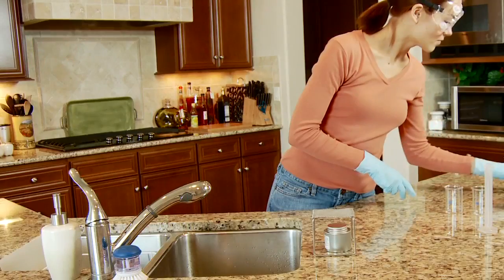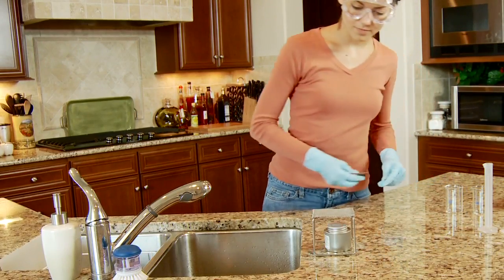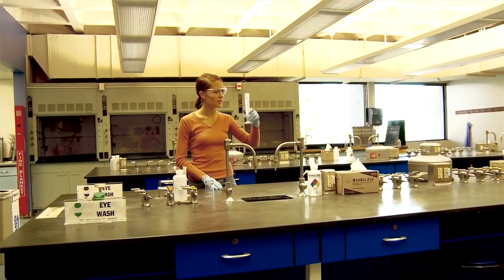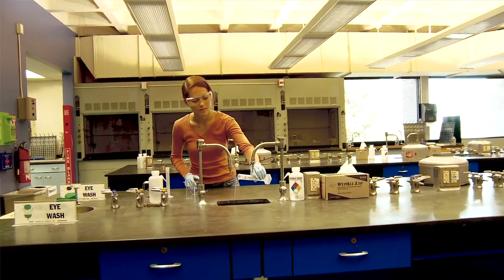In addition, you will learn how the safety information and procedures you perform working independently compared to those safety guidelines, procedures, and equipment you would use in a campus laboratory.